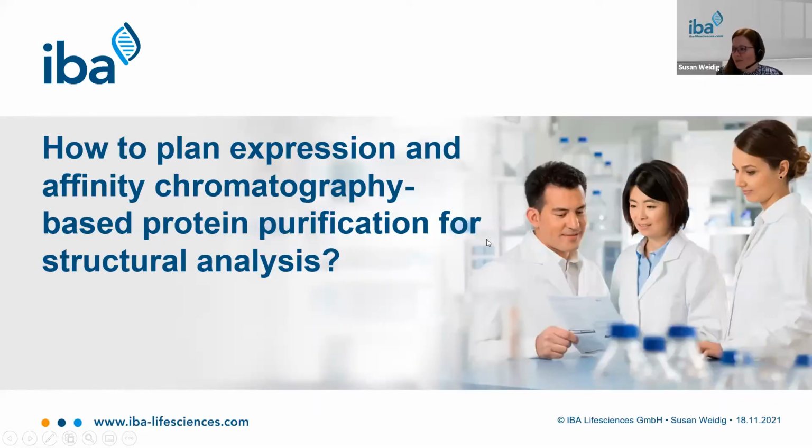Okay, today we have more or less 1 hour to talk about our theme: how to plan expression and affinity chromatography-based protein purification for structural analysis.